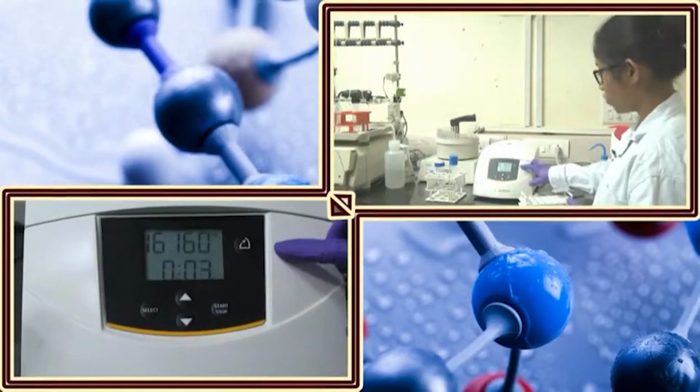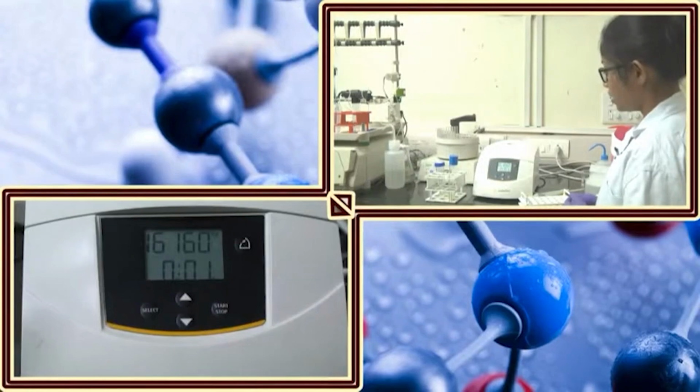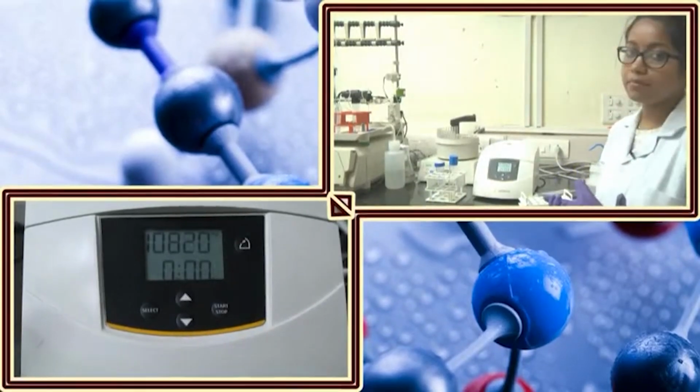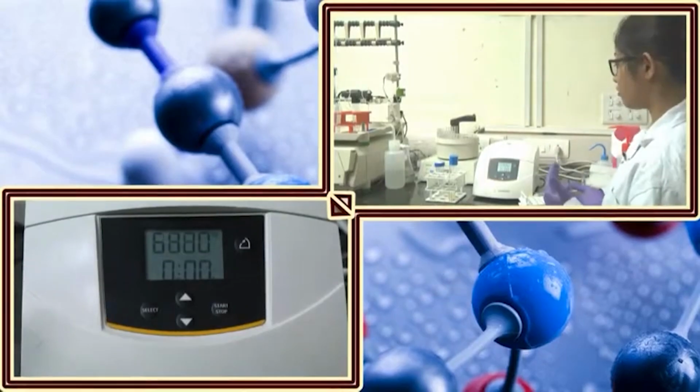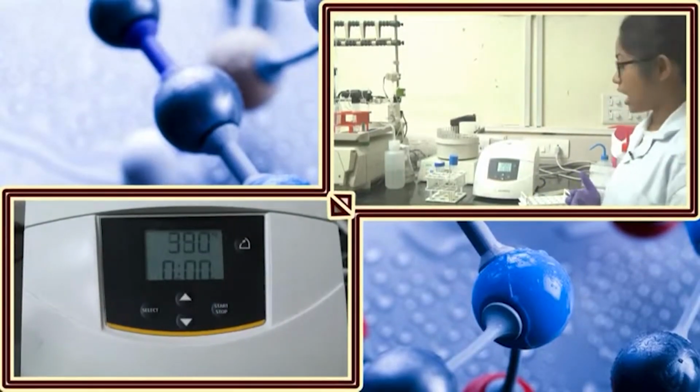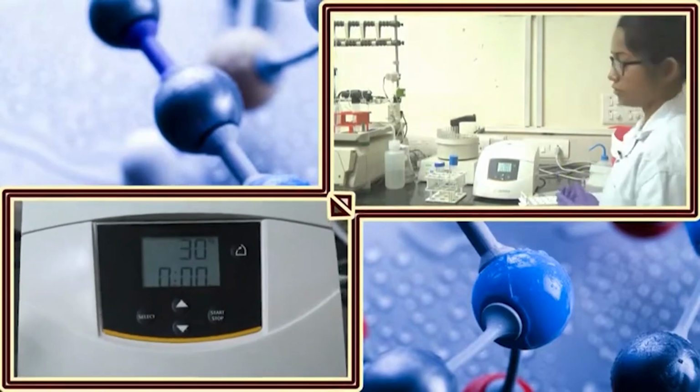Now it is almost over. So, you do not need to stop the centrifuge machine when you give a time like 1 minute or 1.5 minutes. After that timing is over, the centrifuge will itself go down and then it will show me that the centrifugation is over.